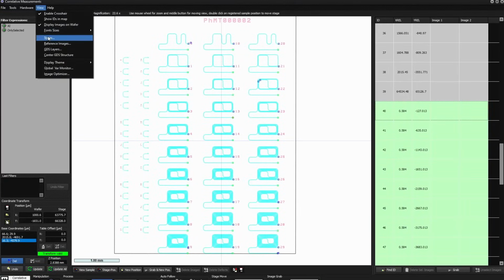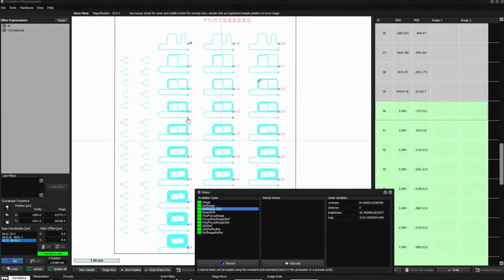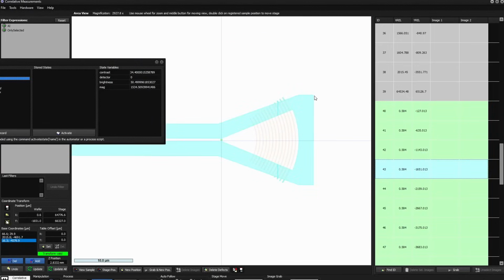We use a state system, call the states. We go here to some location. The idea is to capture the upper right corner and the lower right corner in a close lookup image. For the sequence, we will first take a reference position in the center, then zoom in, then eventually do some focusing, and then take the two images of the corners.